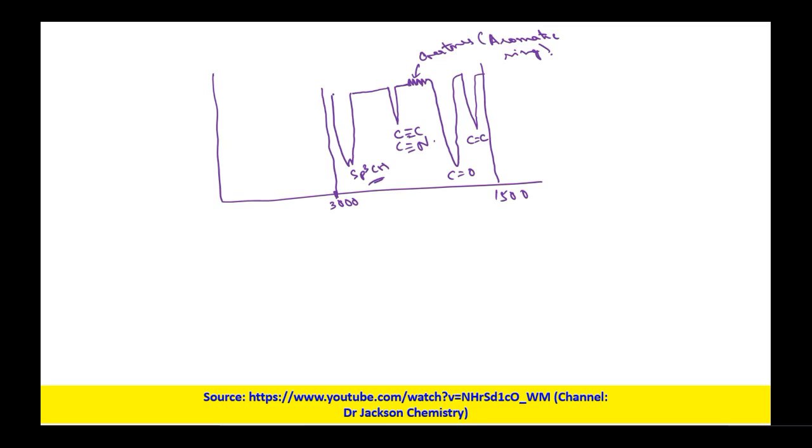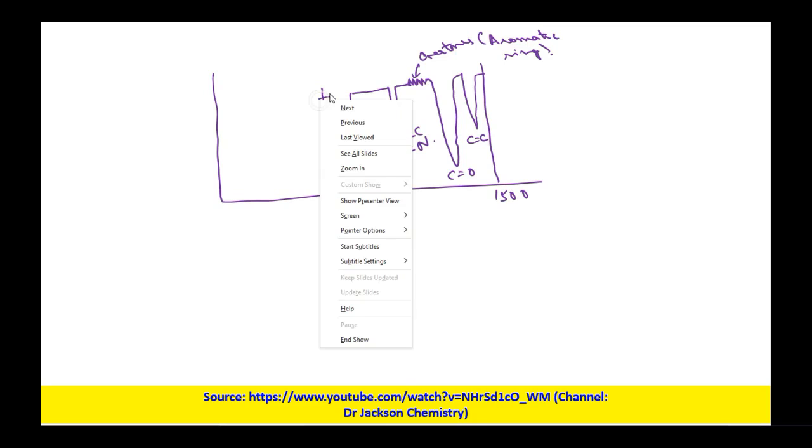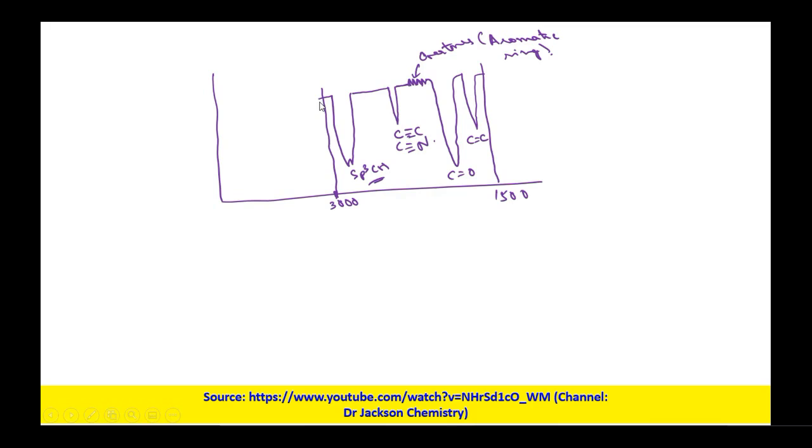Then if it is like this, there is an sp2 CH. And then further as we move, we can have sp CH stretching. Then over here we will be having the OH stretching.